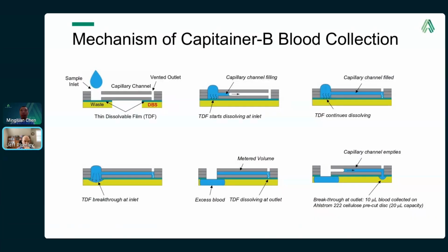Sorry, I skipped ahead a little bit. So mechanistically, how does the device work? Well, it controls the timing sequence of events by the thickness-dependent dissolving time of that thin dissolvable film, or TDF.